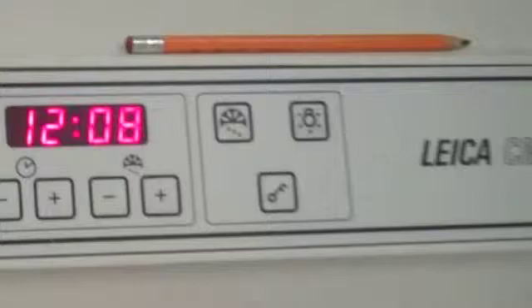The cryostat also allows for a manual defrost. To start this process, press the snowflake button. To lock the cryostat to prevent manual defrost, press the key button. To turn the light on in the cryostat chamber, press the light bulb button.